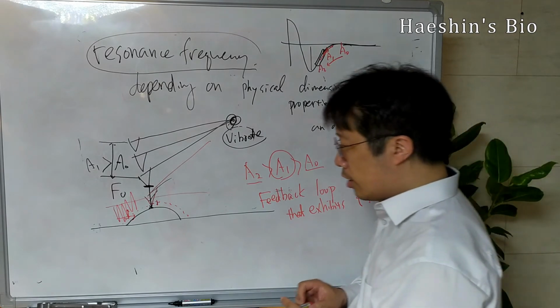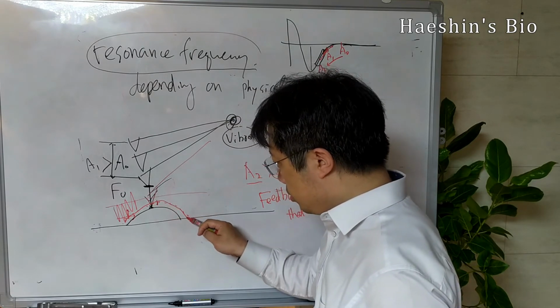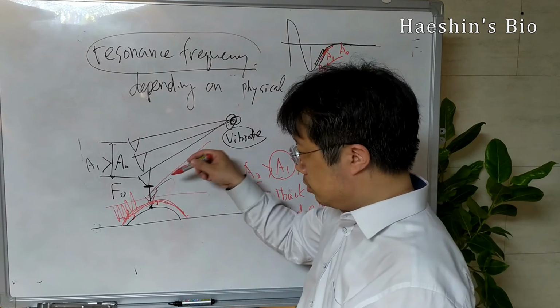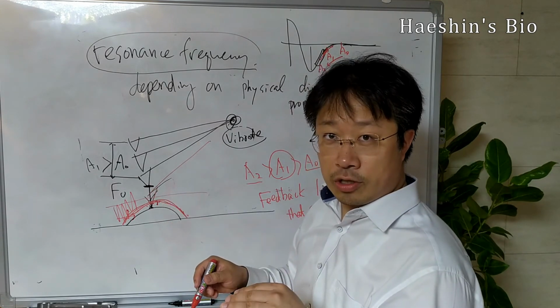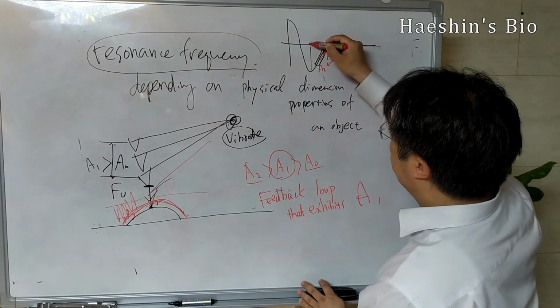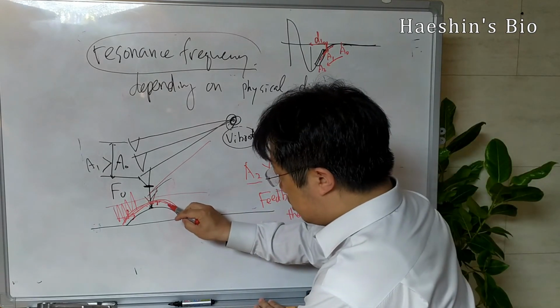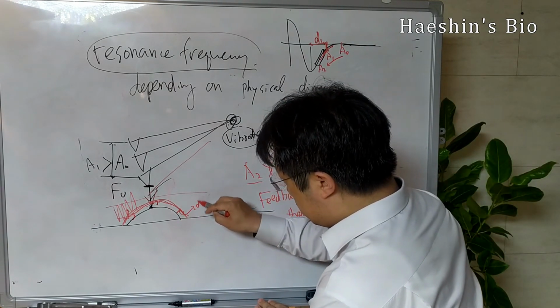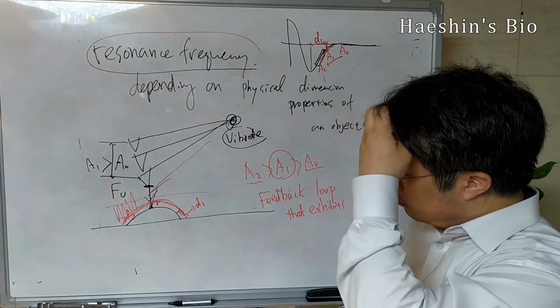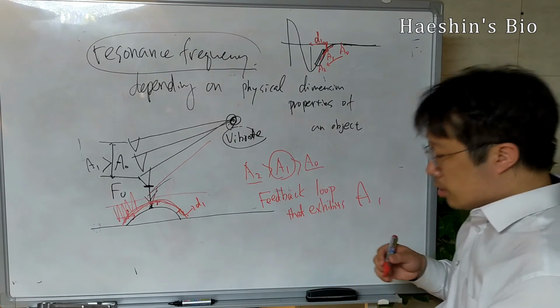That is how they image, following this contour, the imaginary surface of this object. Even if the tip does not touch the surface, they only fix this distance, for example distance 1, continuously. In this case, this can be distance 1, and with the same topology they can actually image. So this is how they operate.